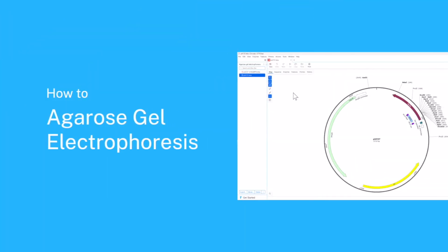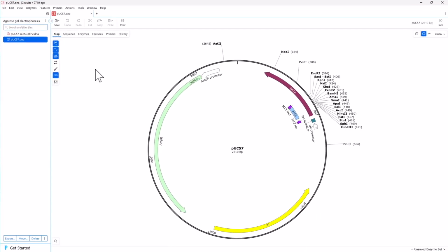Welcome to this video on simulating agarose gels in SnapGene. SnapGene simulates the migration of restriction fragments or PCR products through a gel. You can create a gel in two ways.